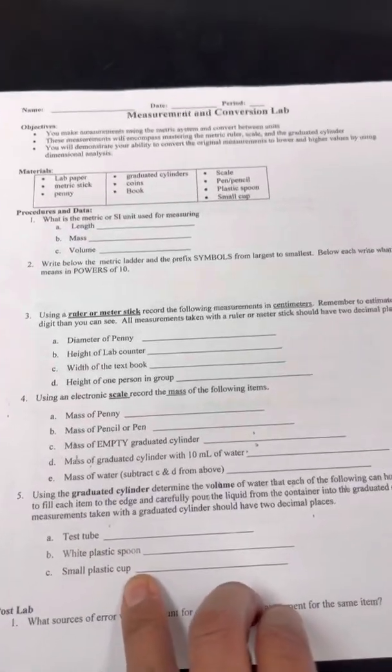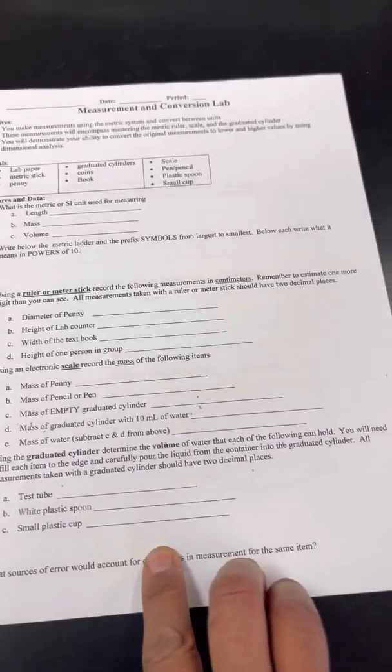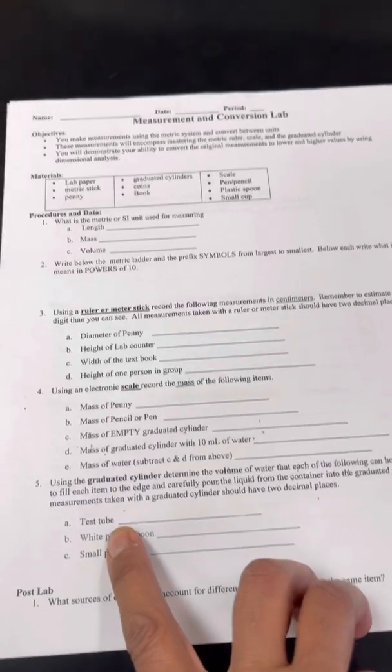The next one is to use a graduated cylinder to determine the volume of each of the following. So we have a test tube. Here's our test tube. And then I'm going to get some water and a beaker to hold it, because I can't hold the camera and stuff at the same time.